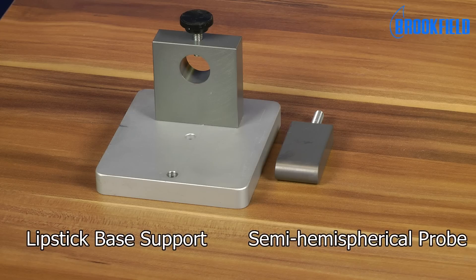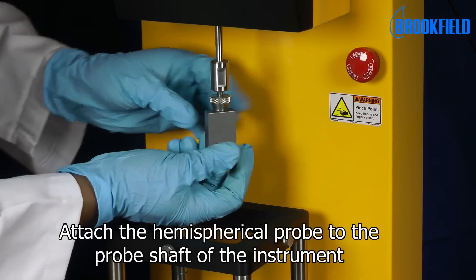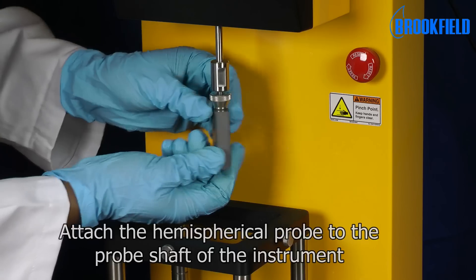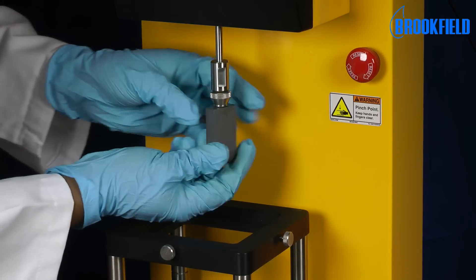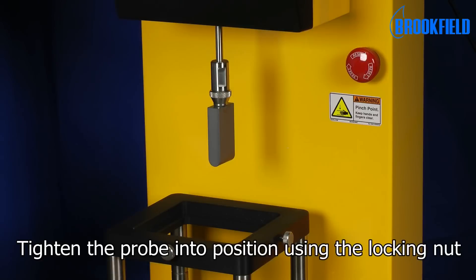Here you see the individual parts of the accessory. To set up the test, attach the hemispherical probe to the probe shaft of the instrument. Tighten the probe into position using the locking nut.